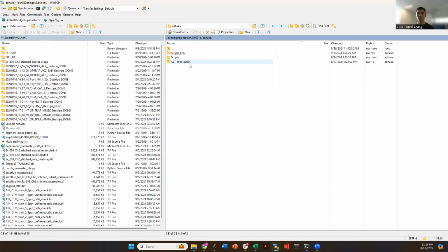So say you have a 0.7 F1 score from this classifier. What you can do is apply the same classifier to your next batch and just test if the F1 score for the new data set is similar to the F1 score that you generated in the previous data set. If it's very similar, you can say, yes, we can just apply this classifier across subsamples. If it doesn't, you maybe want to retrain a classifier. What you don't want to do is compare results coming from an F1 score that's 90% and an F1 score that's 70%, right?